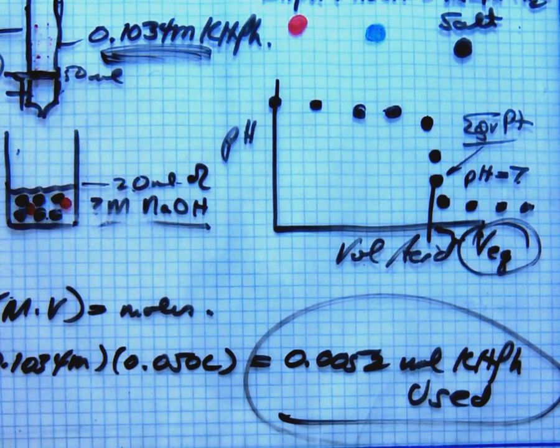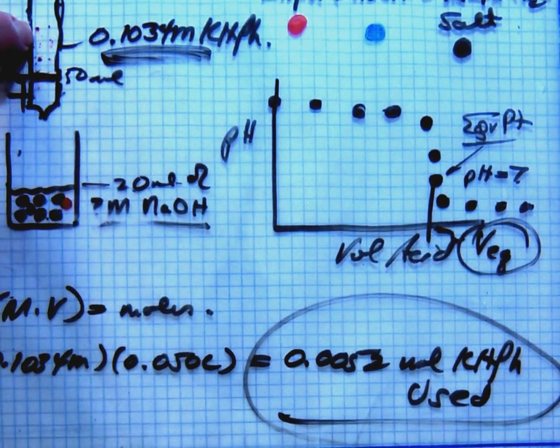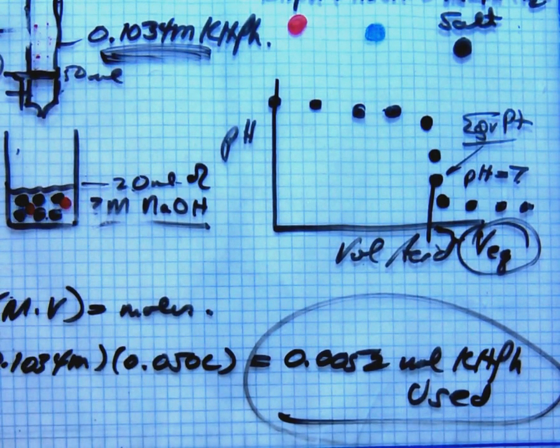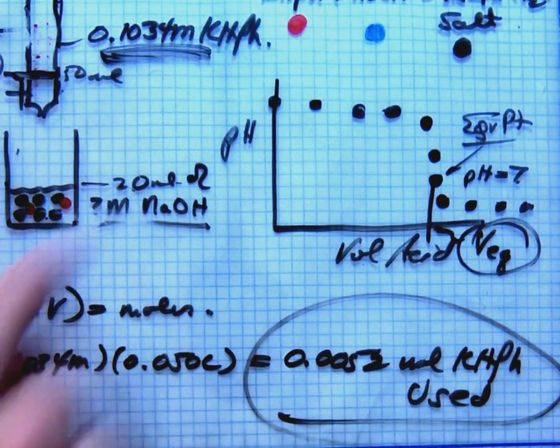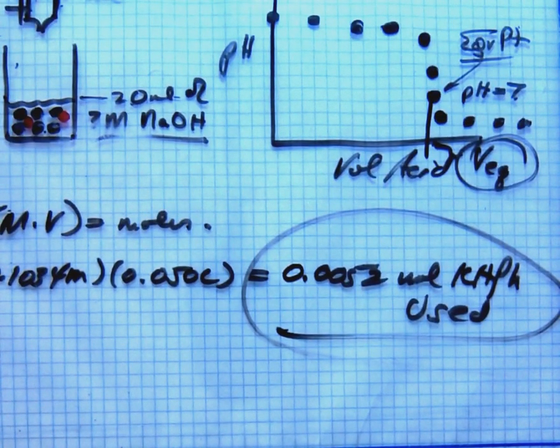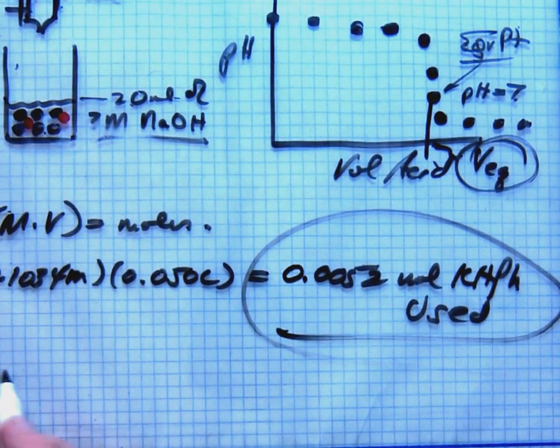Okay. We've got 0.0052 mole of KHP that we used out of the burette. How much acid did we neutralize? Same amount, because it's a 1-to-1 reaction ratio, right? If we've got this many moles in 20 mils, what's the molarity of our solution? We got that much over 20 mils, so it's moles over volume in liters. So now we can finish our little calibration.